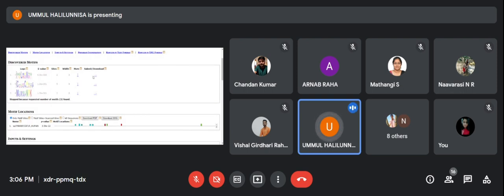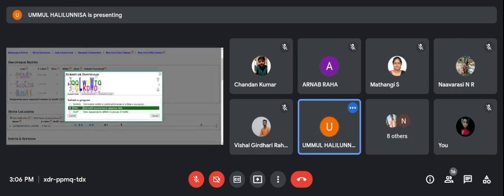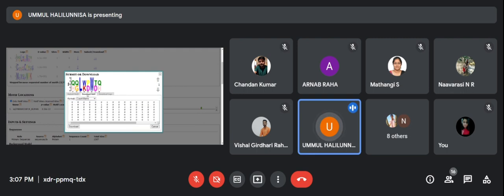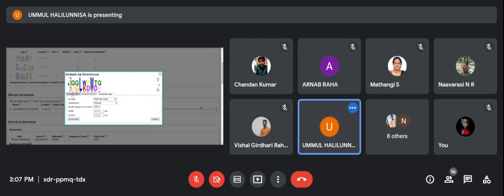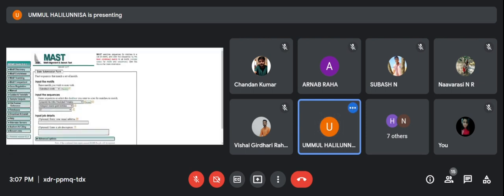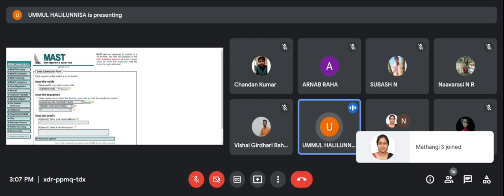And if you want to submit or download, here we will go for FIMO, TomTom or MAST, because we want to find similar motifs in any other existing species which have similar motifs. We can check through this one. So then it will lead into another page called MAST.